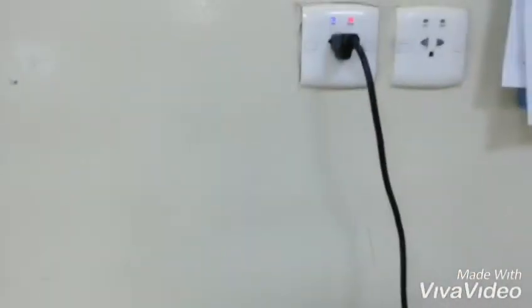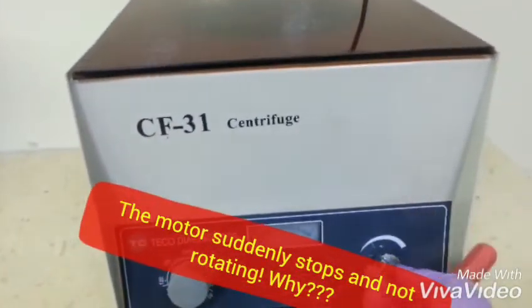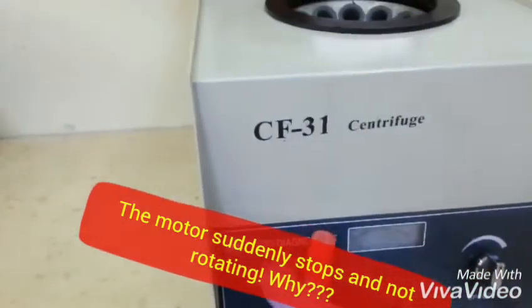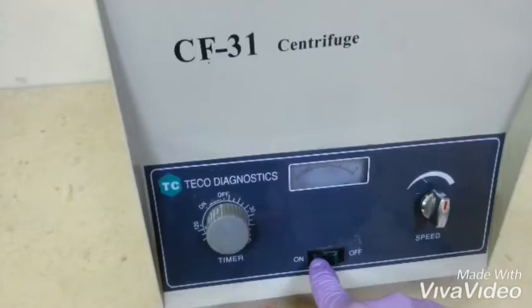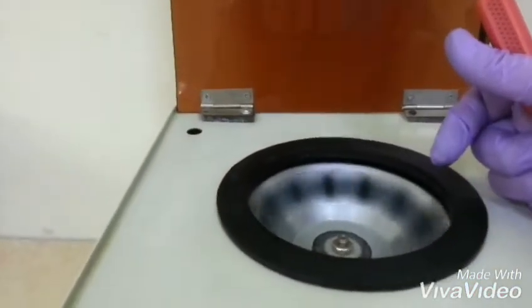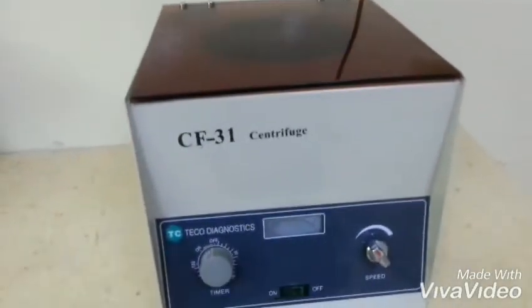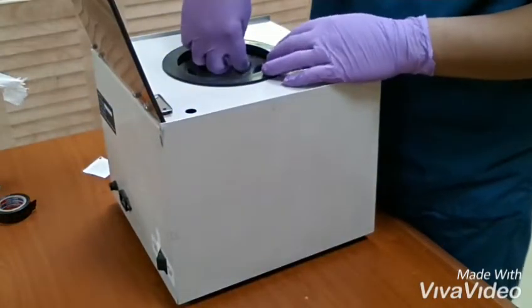As we can see, we put on the electricity and turn on the machine, but there is no response from the machine. The motor is not working even if you put it on full speed. There is a small light that indicates the electricity is on, but the problem is there is no response from the motor. So we will open the machine to find out what the problem is.